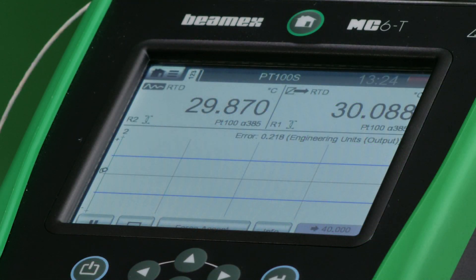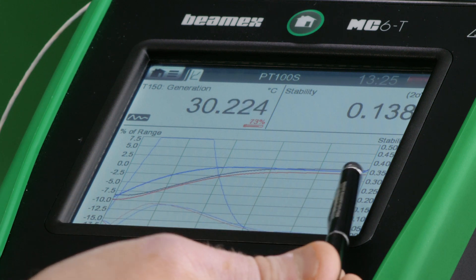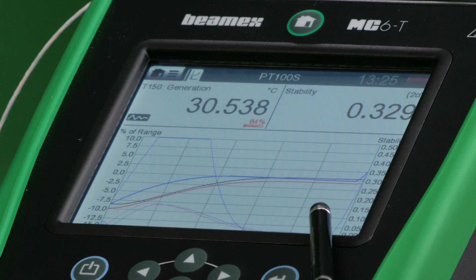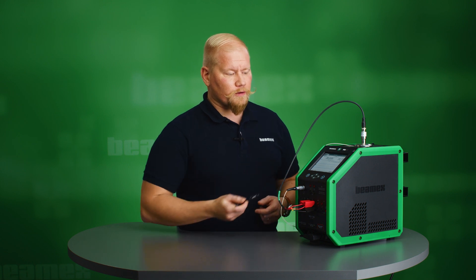The MC6T has now reached its first set point and recorded it. We can see it has started heating, so the temperature graph is going to go up and the stability indicator will also rise as the temperature changes. We are now heading for the 40 degrees Celsius set point.